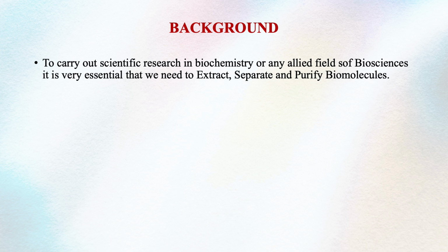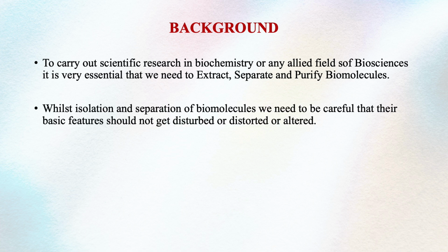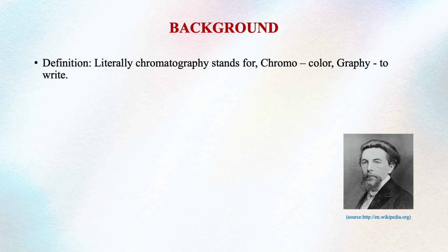Whenever you separate proteins, it is important to take care of their basic structure, and we should not disturb their activity. So in these techniques, we will take the detailed, minute precautions needed while separating biomolecules using paper chromatography.